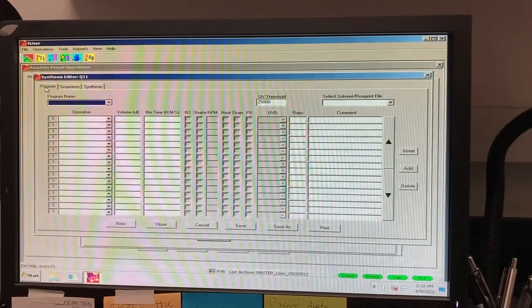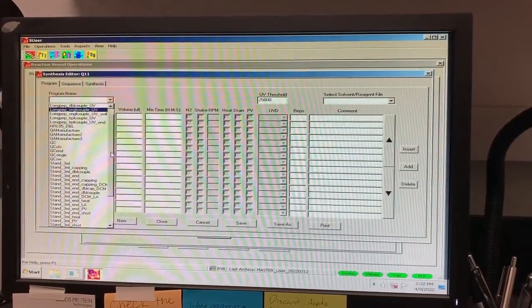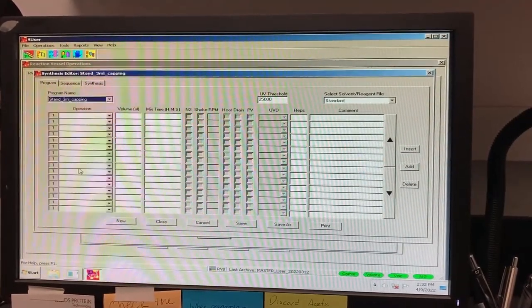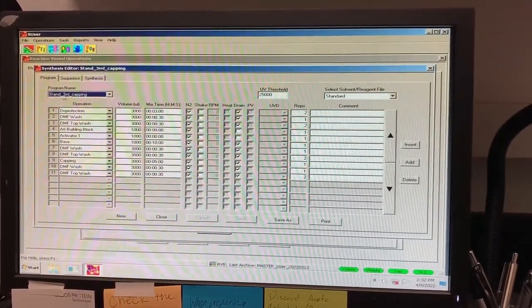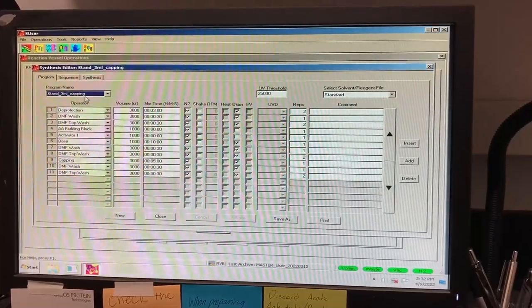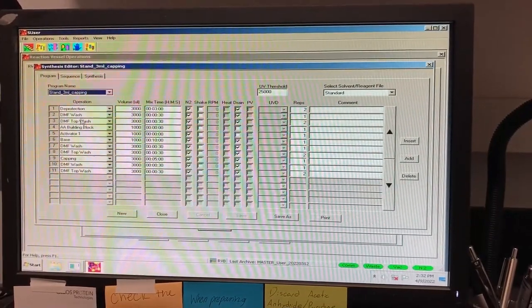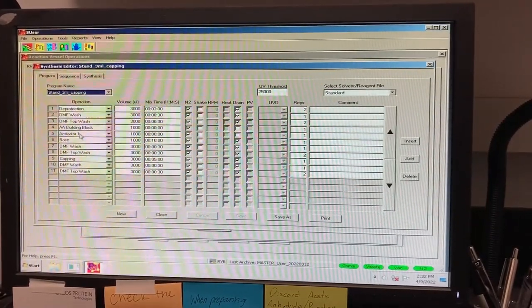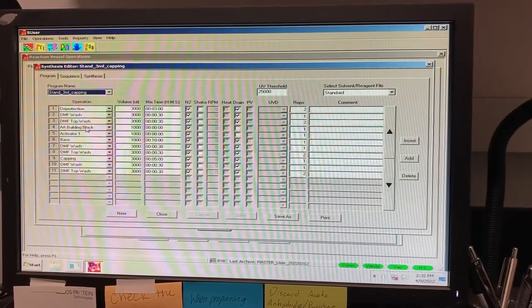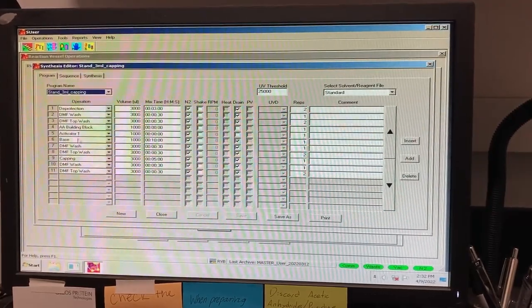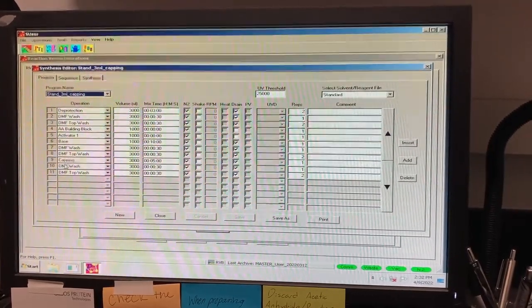If you look under the Program tab of this window, you can look at each program set in detail. The Standard 3 mL Swell Capping Program step, for example, encapsulates the initial swelling of the resin, deprotection, coupling of the first amino acid, and capping of the unreacted amines.